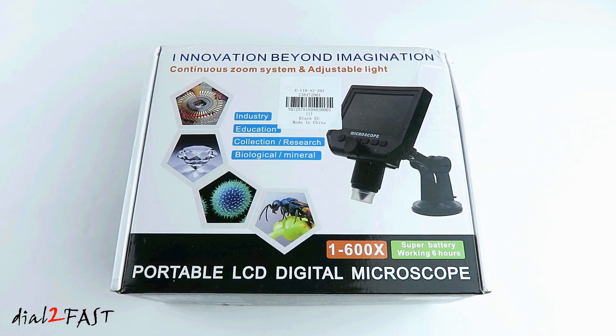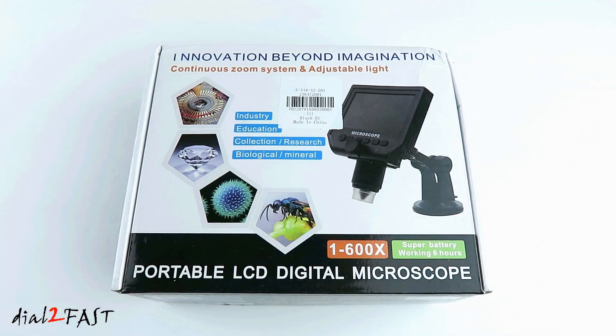This unit has 600 times magnification, the image has a 1080p high definition resolution, and it's displayed on a 4.3 inch color LCD display. There's also a built-in 2500 milliamp hour lithium polymer battery which can operate for more than six hours.